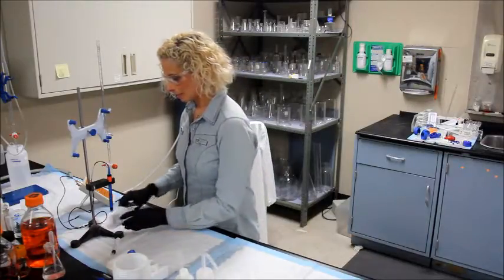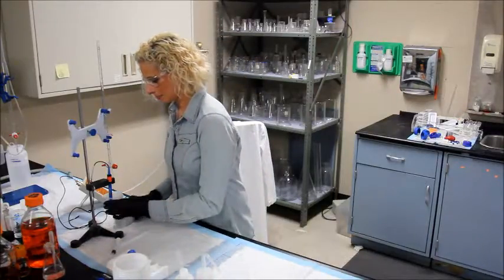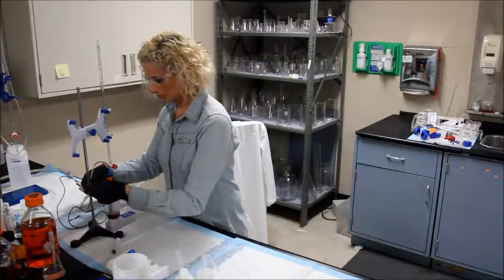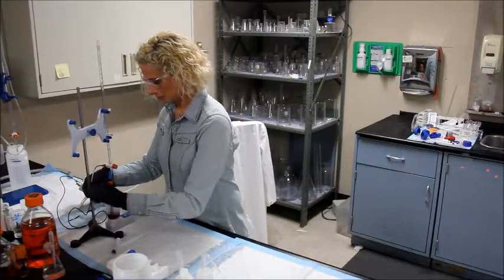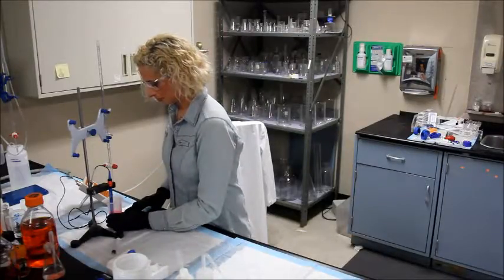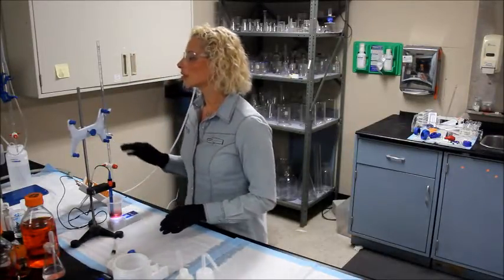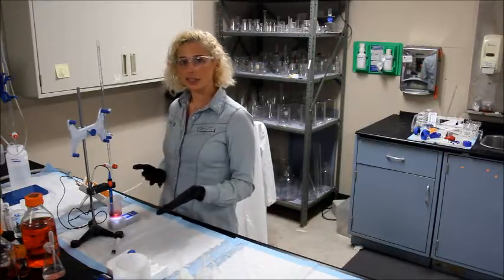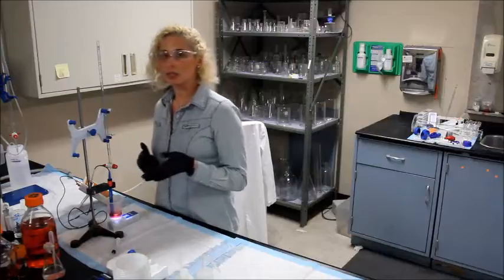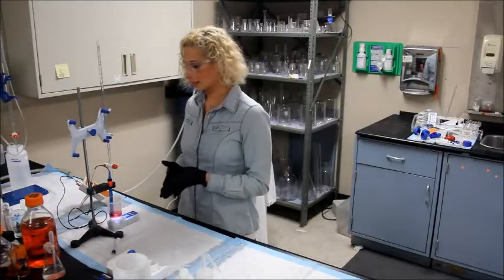Place the stir bar in your cup and turn the magnetic stir on. If you want to do a TA titration, you can — just note the starting volume — but you don't need it for the YAN analysis.